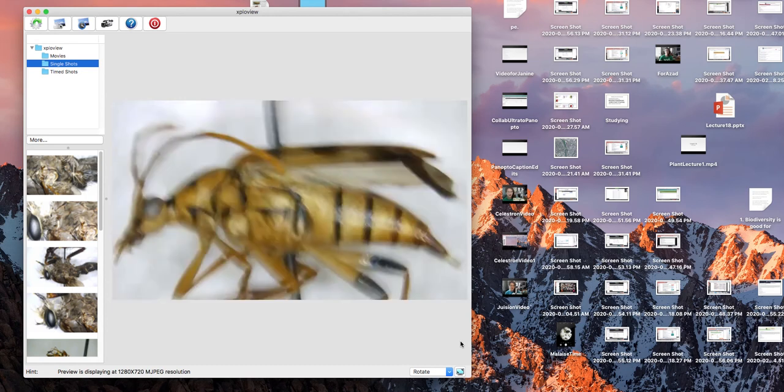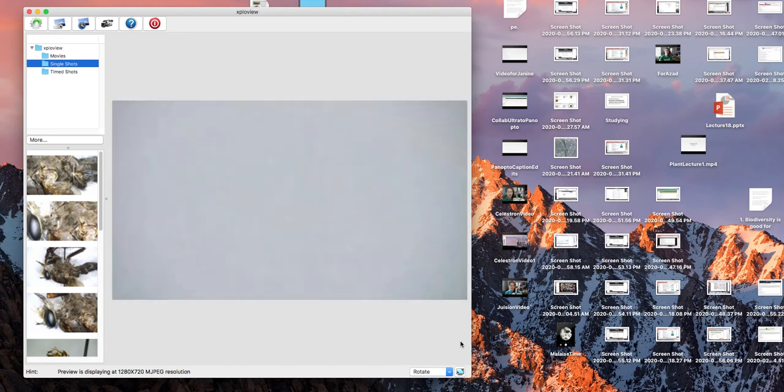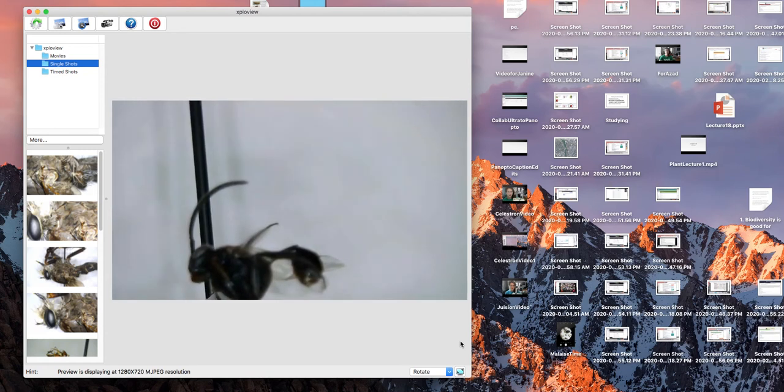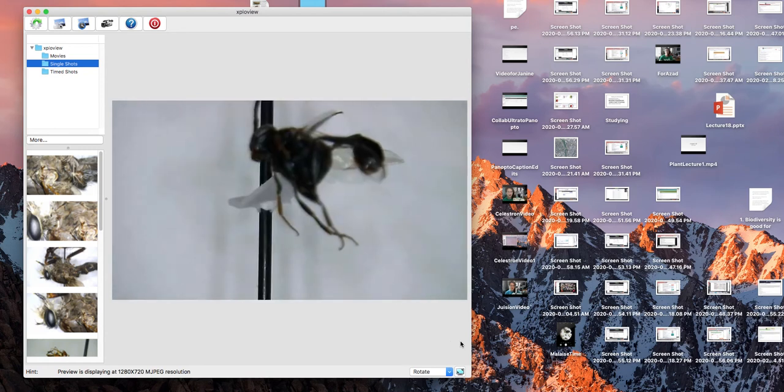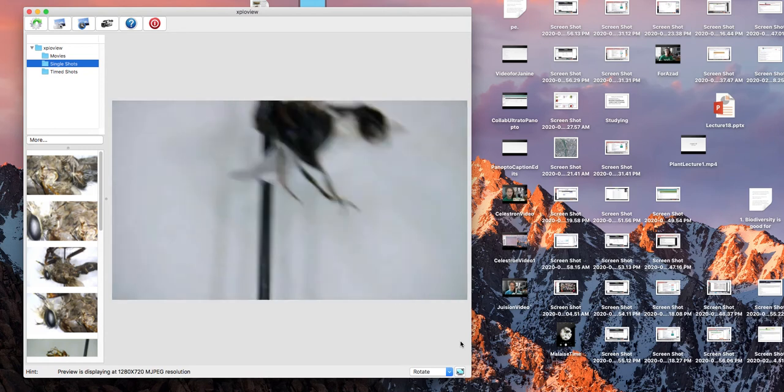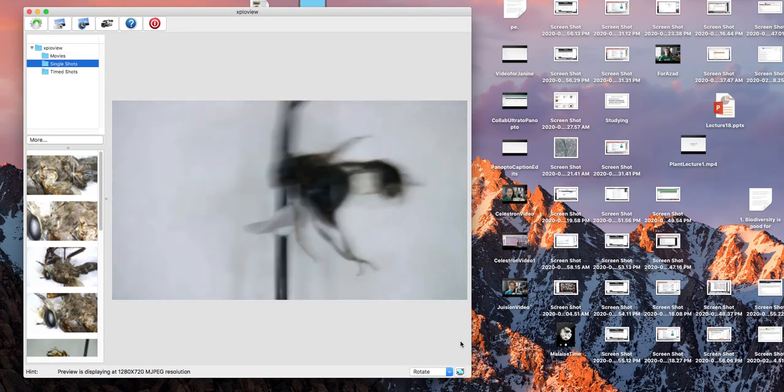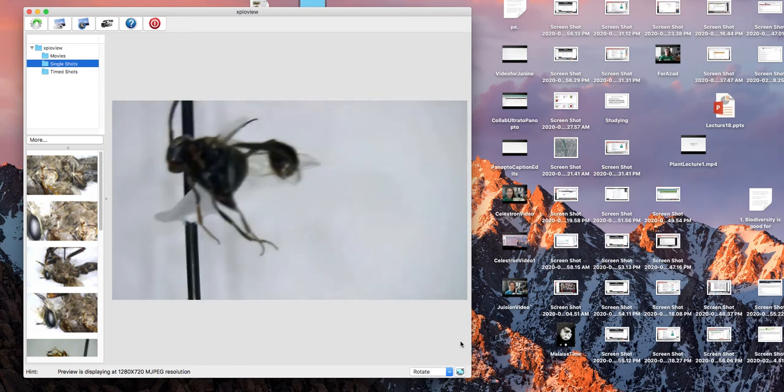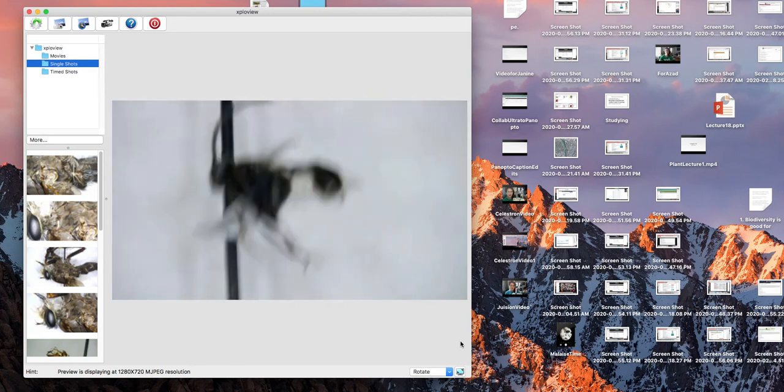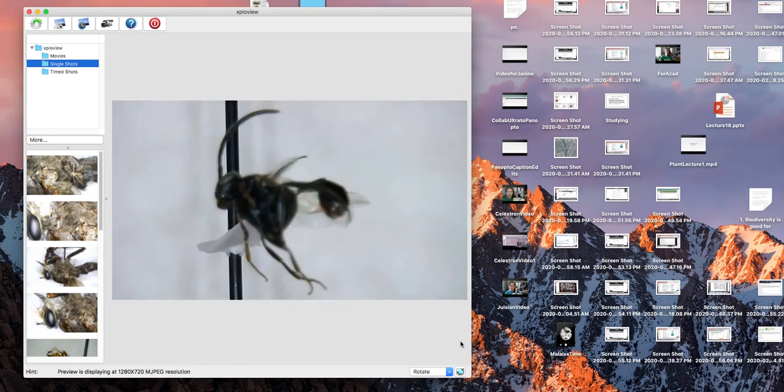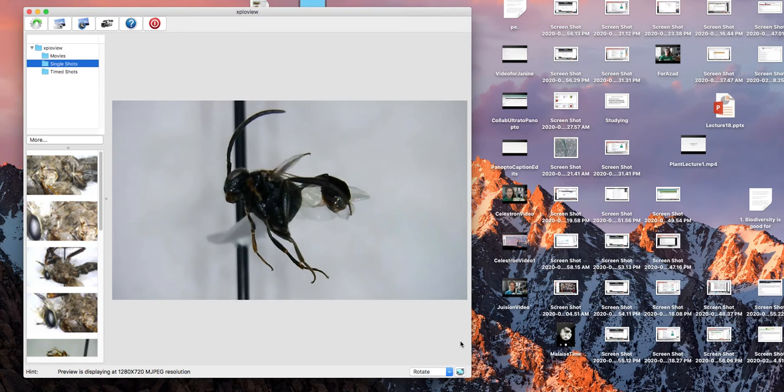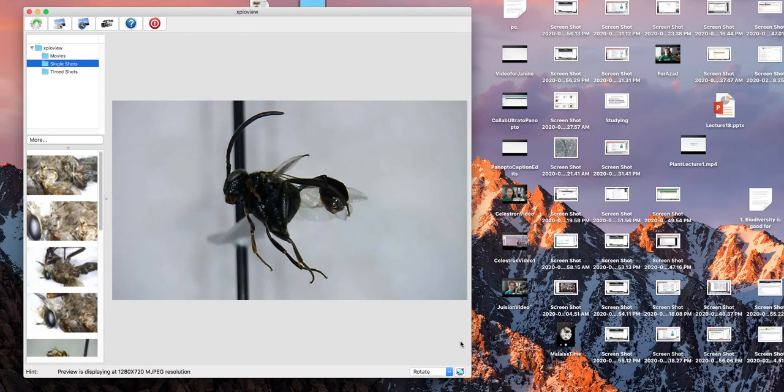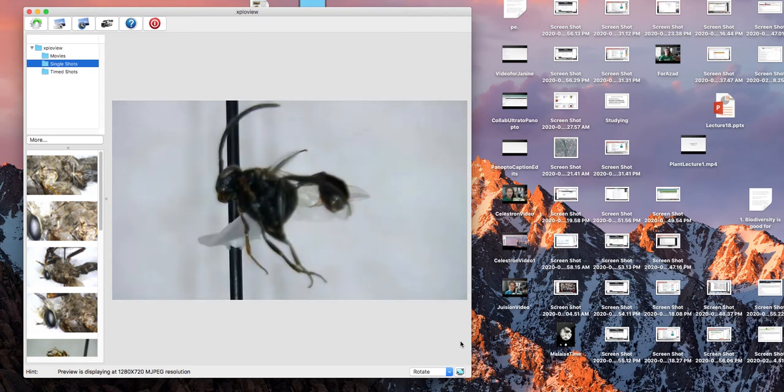Let's go with a smaller insect. So again, we're going to go with that shiny, dark black wasp, probably around three to four millimeters. When you have something that's dark and shiny like this, this is going to be very challenging to take a good photo or video of, even with a regular microscope.